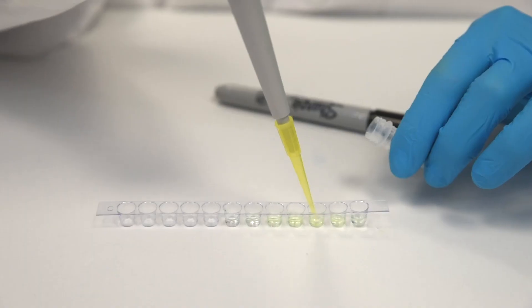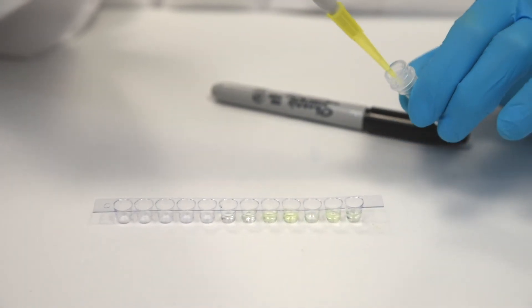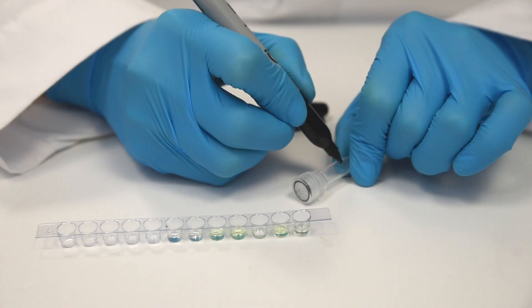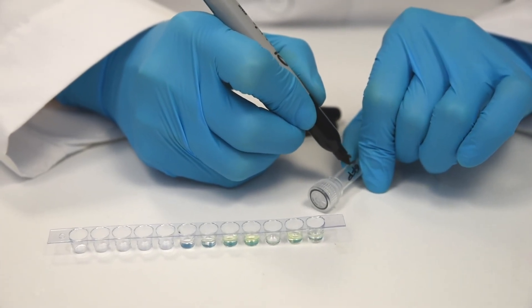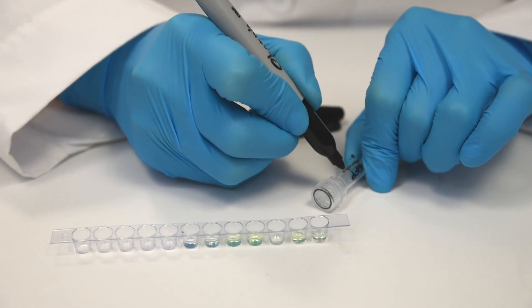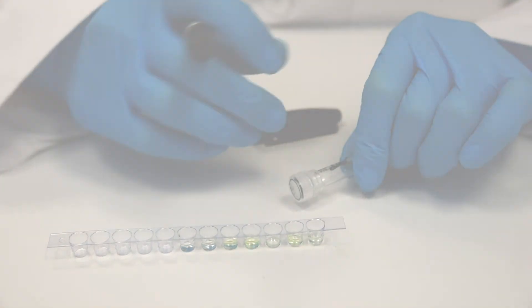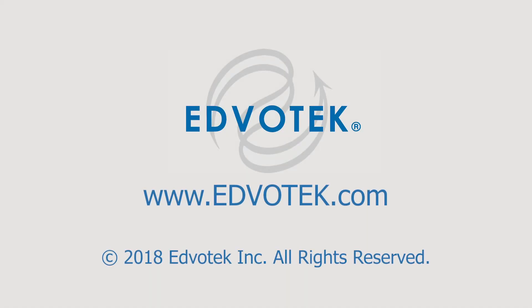Step 8: Transfer an additional 30 microliters of the same elution to a second screw-top microcentrifuge tube. Label this tube GFP denatured. You are now ready to proceed to Module 4, Analysis of GFP by SDS Gel Electrophoresis.